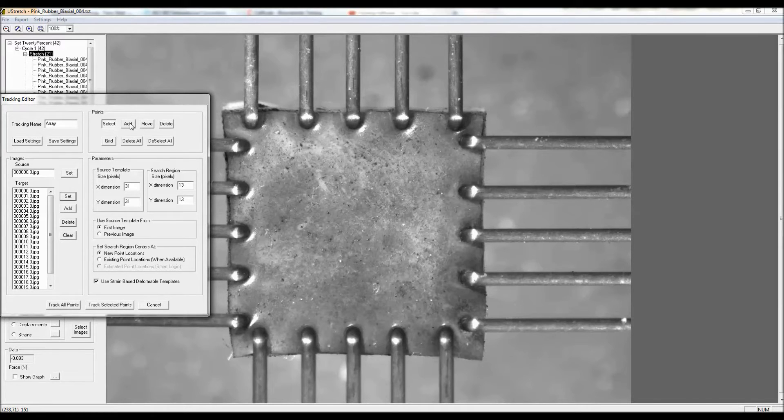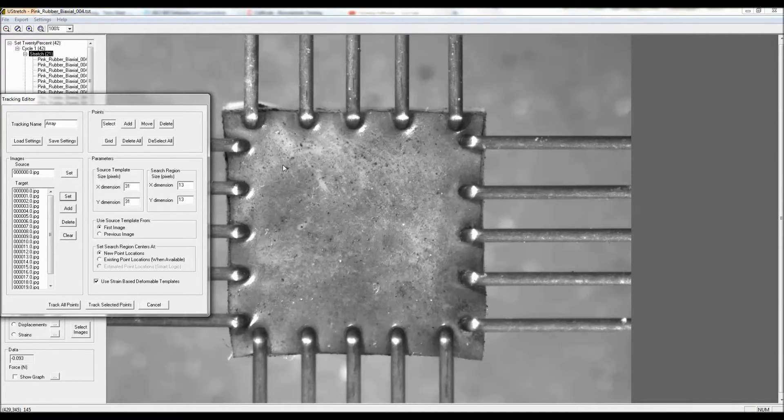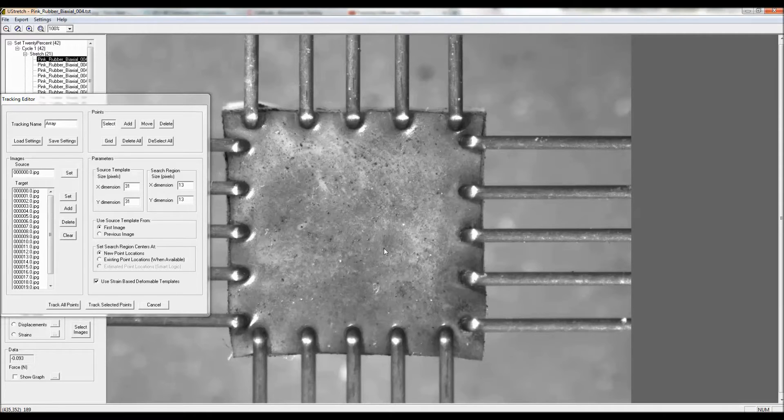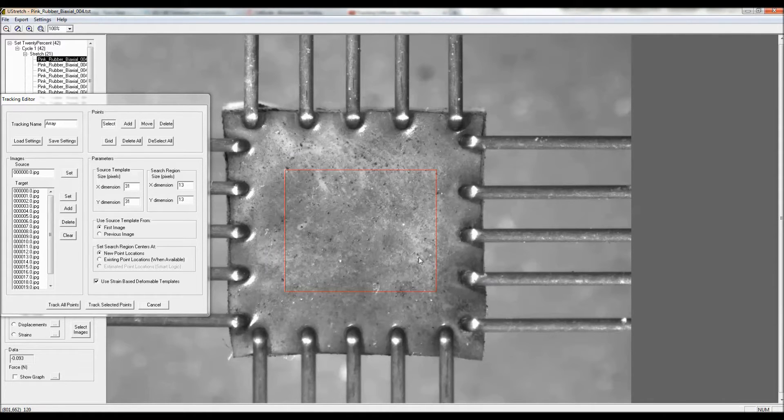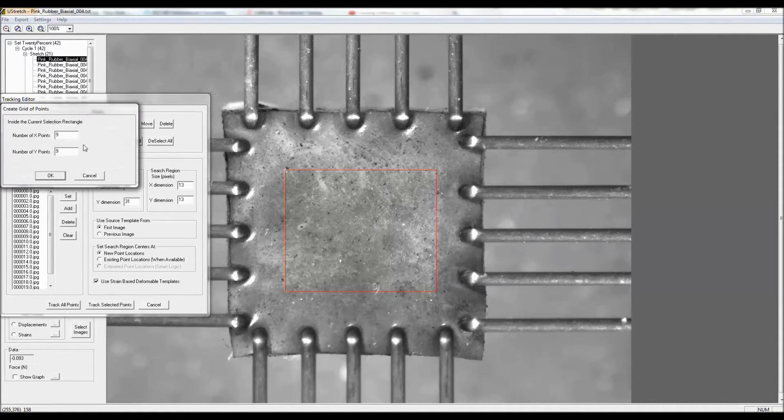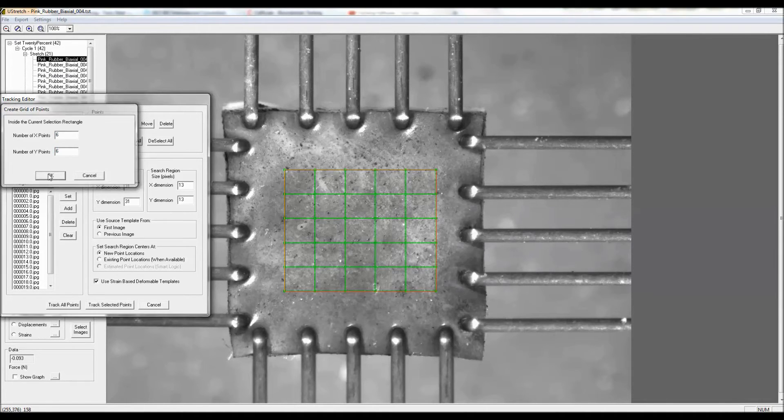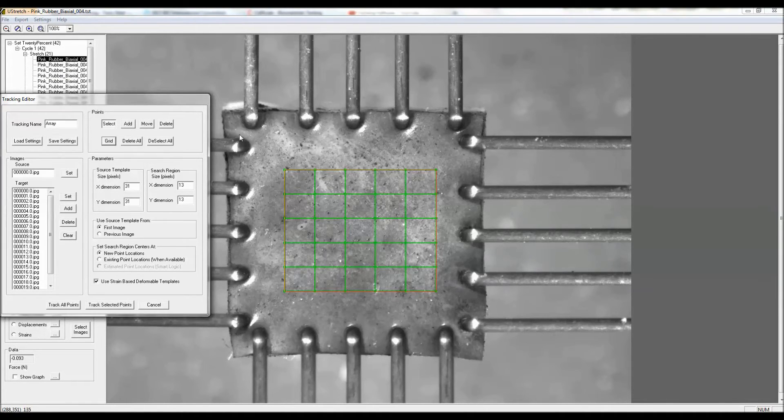Instead of clicking the add features to add individual points, what I'm going to do this time is select a box on the surface of the specimen, and I'm going to put an array of six by six points inside that box.